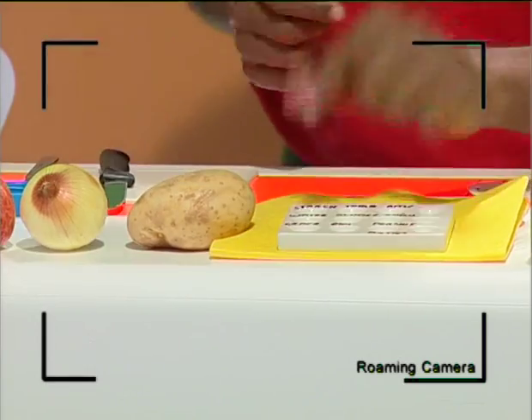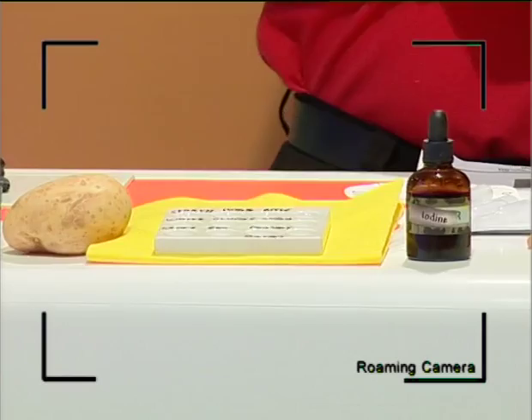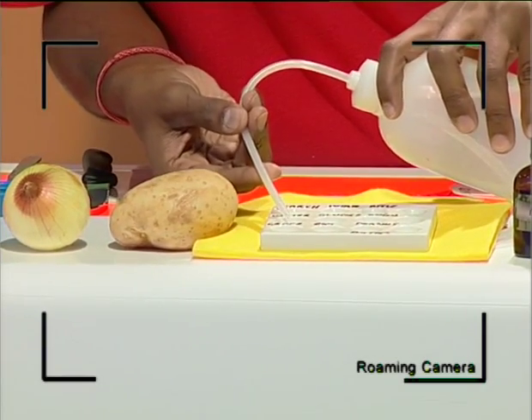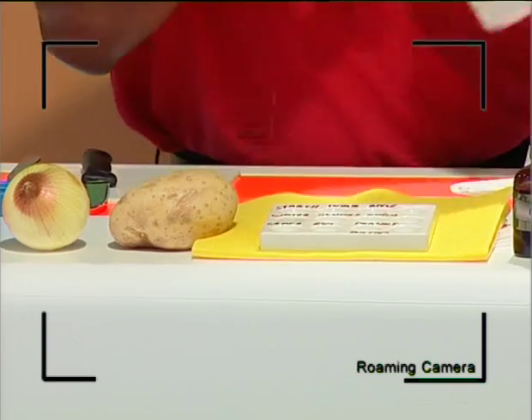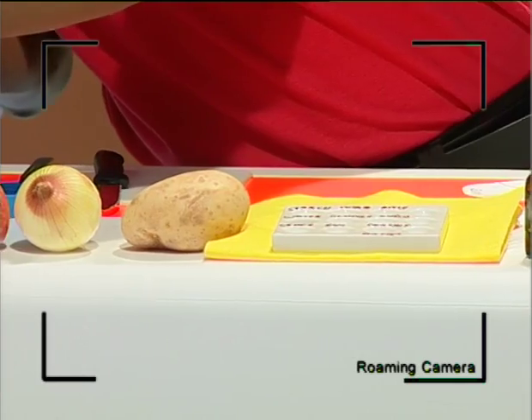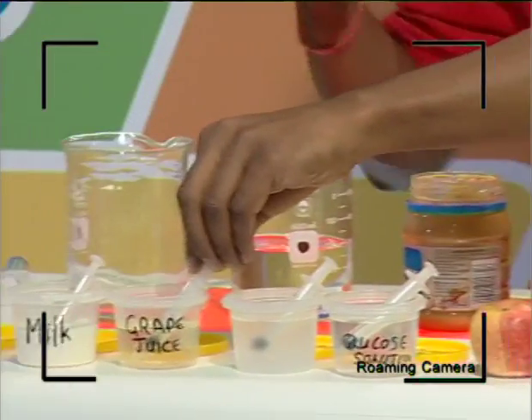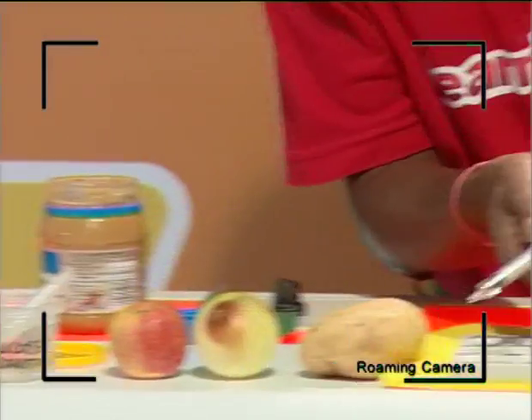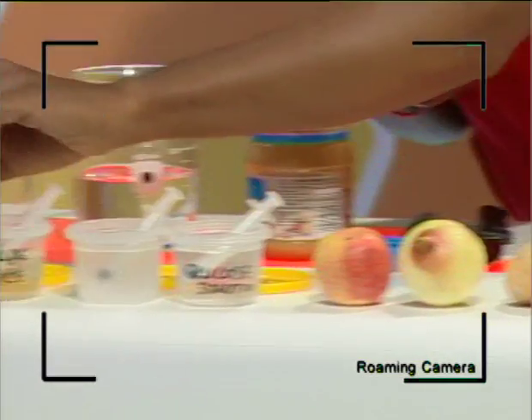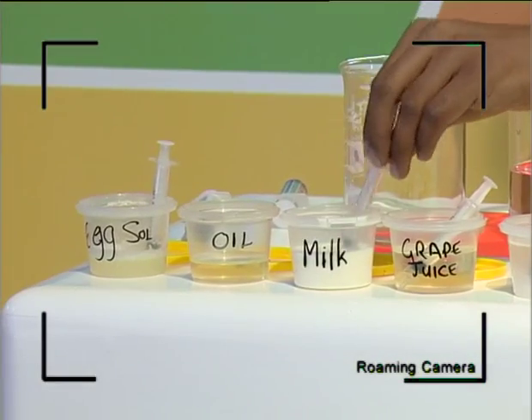Then the next one is water. I'm going to try and get in some more water here. Very little, not too much. Okay, just enough. And then we've got grape juice there, a bit into that. Unfortunately, I'm not going to be able to lift this up for you guys because it's going to spill, but if we need to get closer, Wilson's going to zoom in and give you a good look at this.